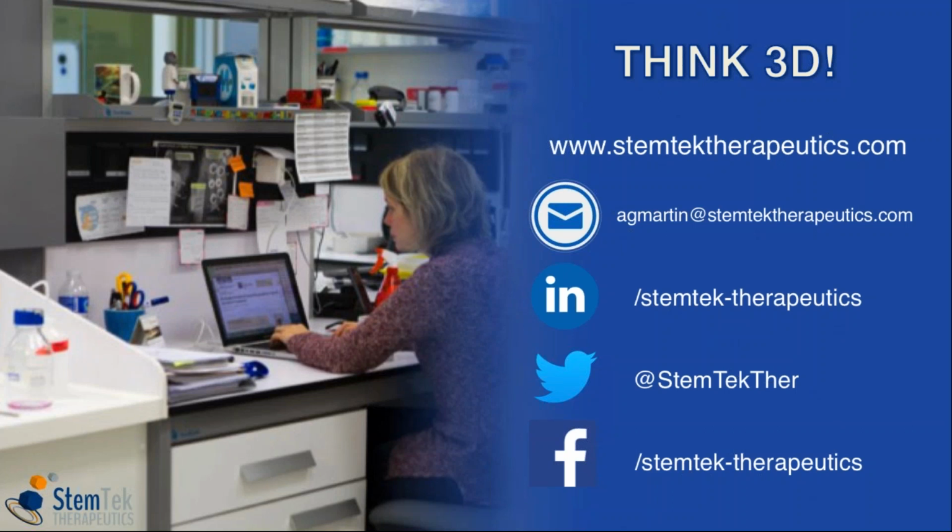Okay, that's perfect. And my last question is, you mentioned that new cell lines or new products will come using different cell lines. Can you give any estimation when new cell lines will be available and which will come next? So we are working with a lot of cell lines all the time. There are hundreds of cell lines. Obviously, we cannot have them all, but our internal process for validation is very rigorous. So we make sure that every cell line comes in a very robust way after freezing, and not every cell line is actually suitable for that.